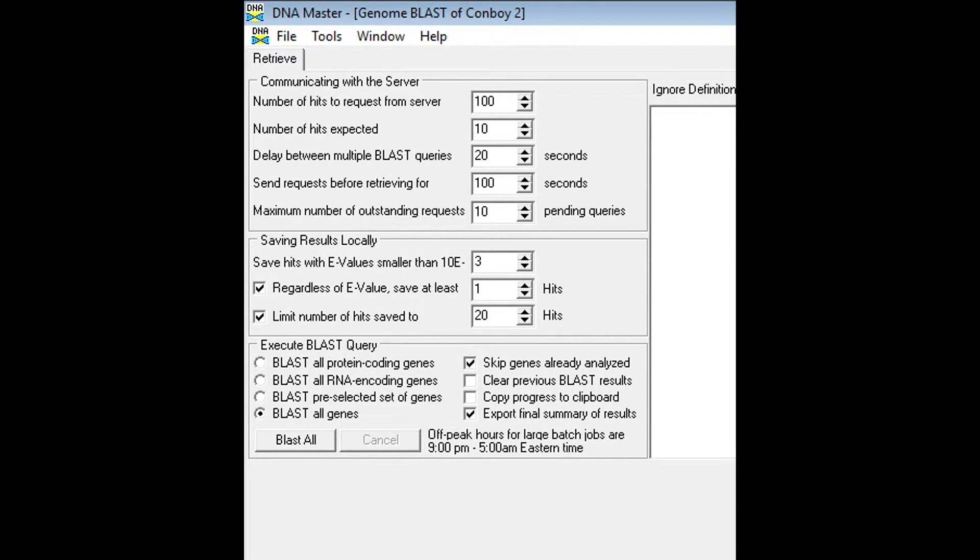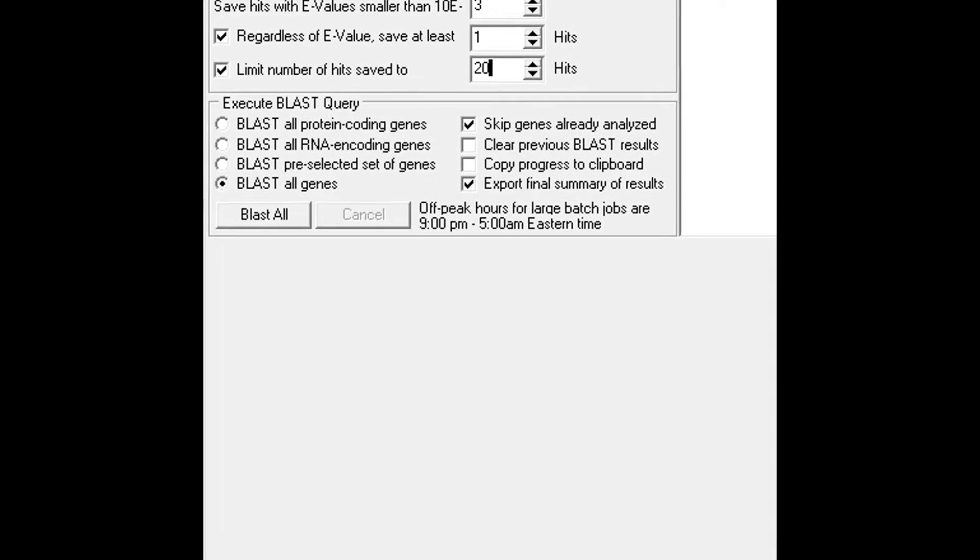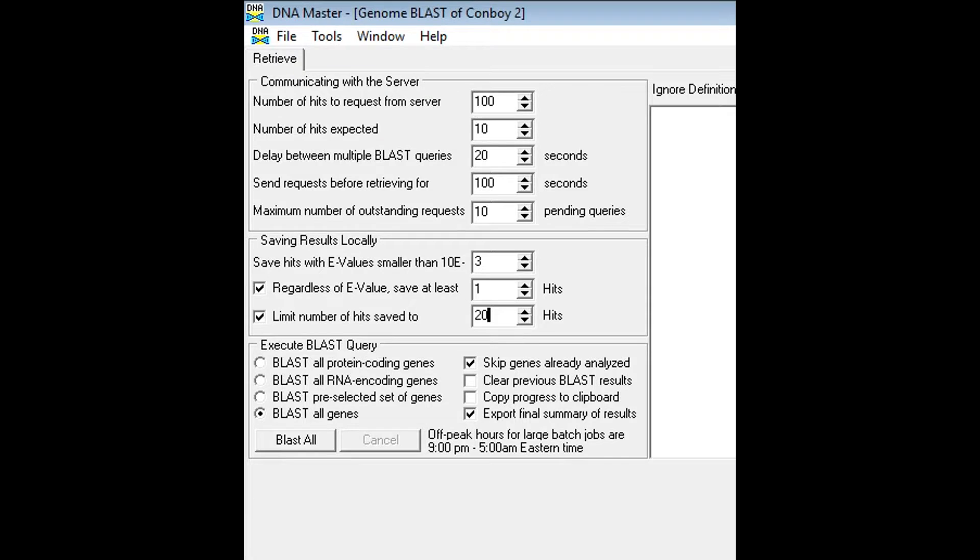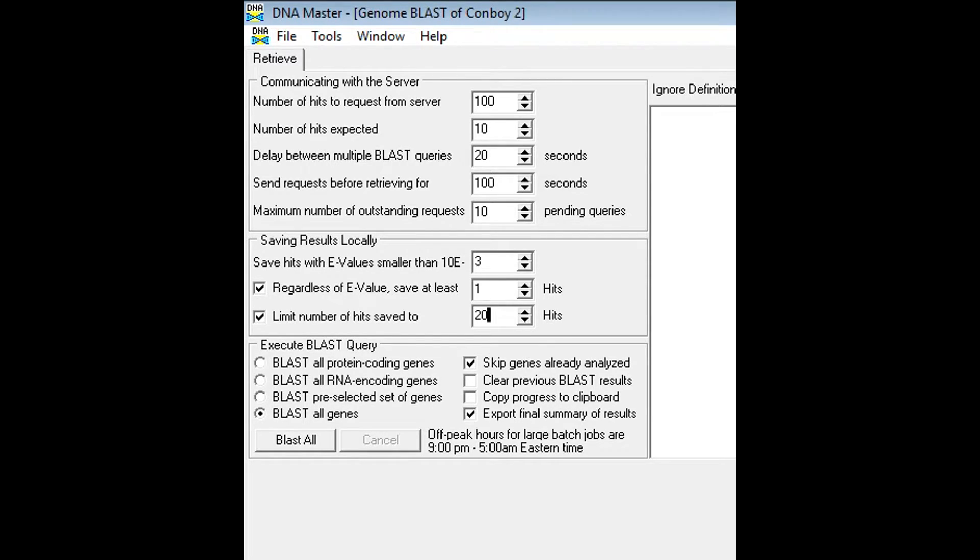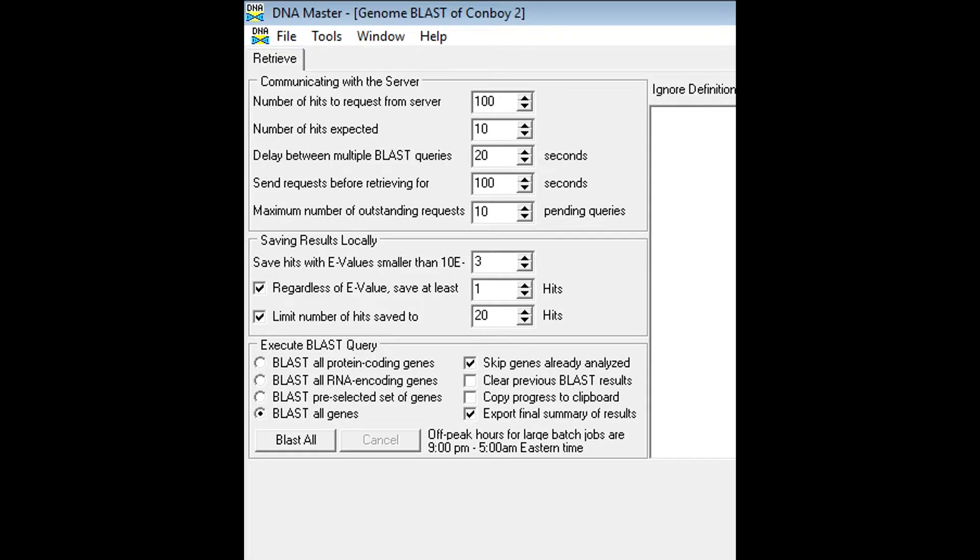Right now we're in peak hours as you'll see here in the bottom left hand corner. During peak hours the load on the servers is a little heavier and your blasting may take a little bit longer. Sometimes if you want you can blast all the genes overnight. It won't take as long and may save you some time later on.